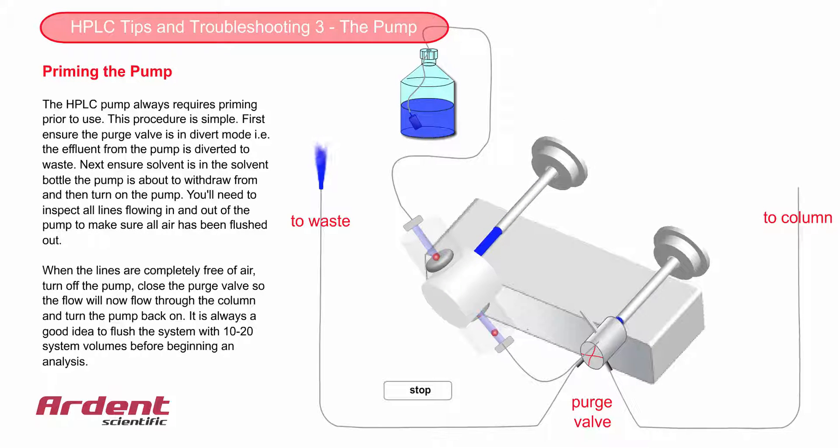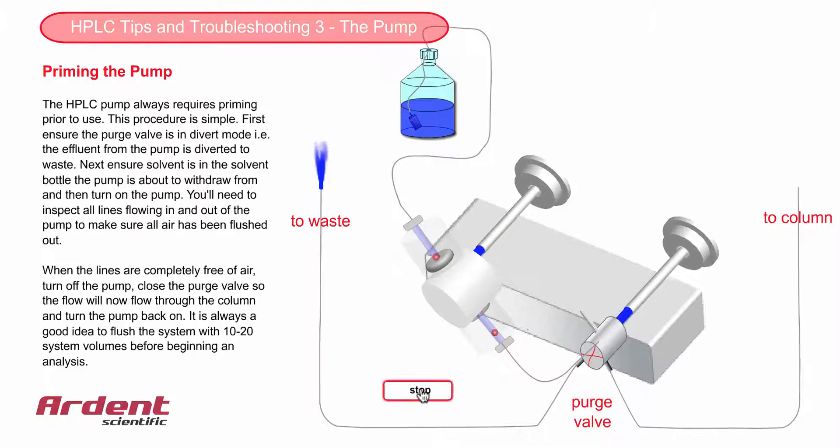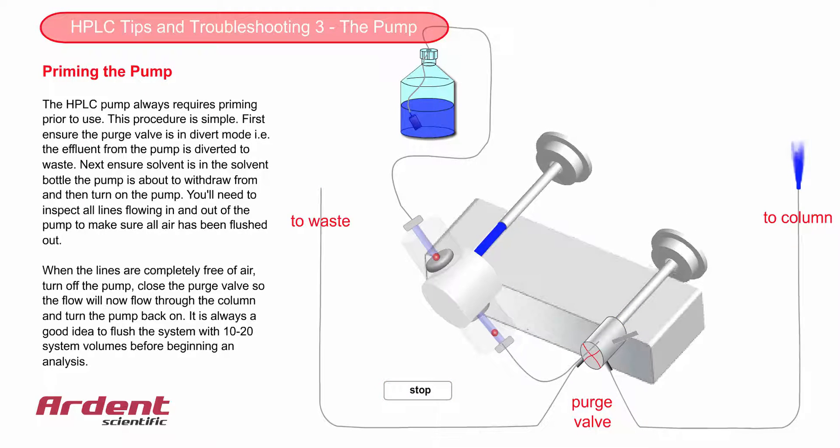When the lines are clear, turn the pump off, close the purge valve, and turn the pump back on. I always do this in this order so as not to pressure shock the column.